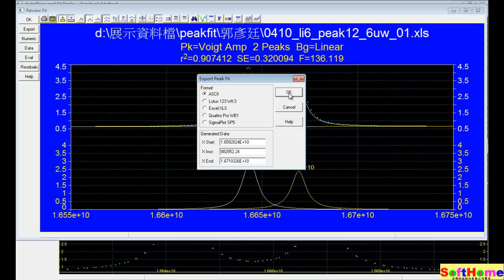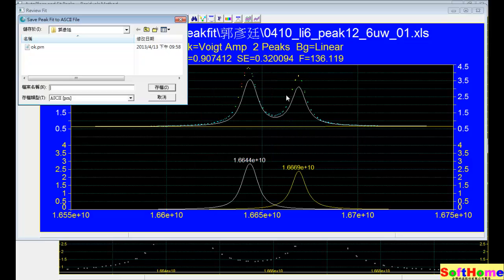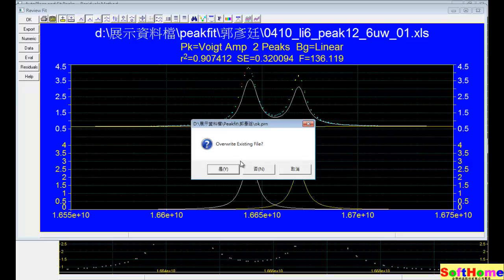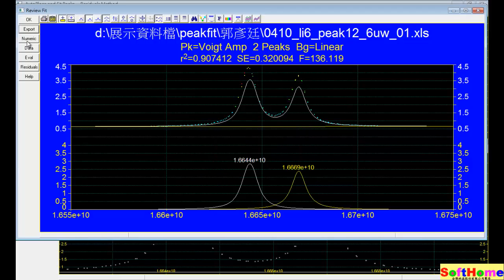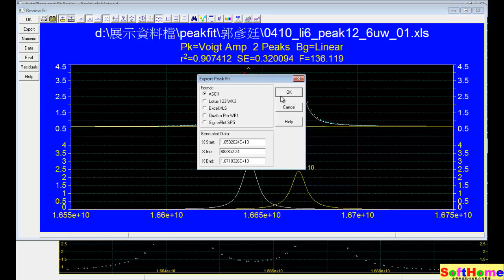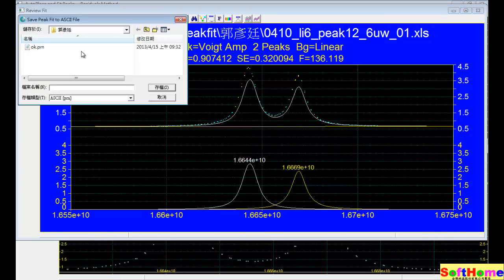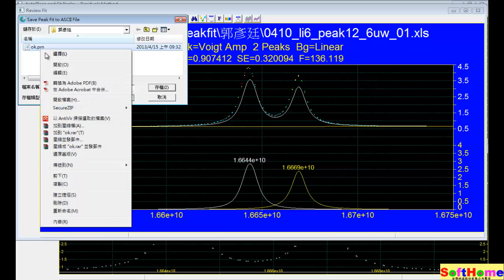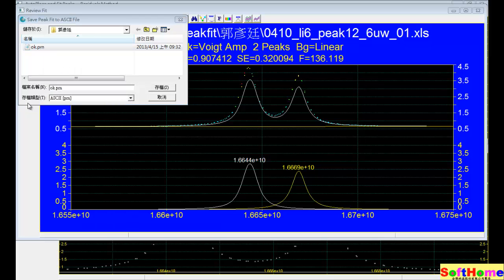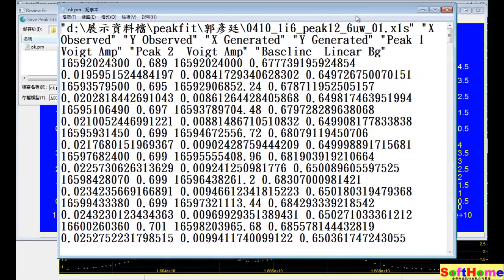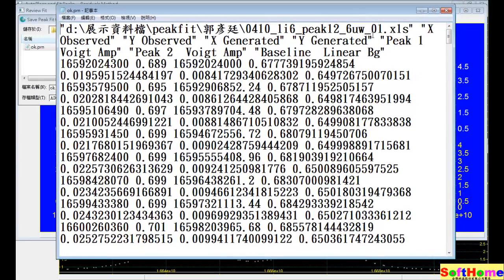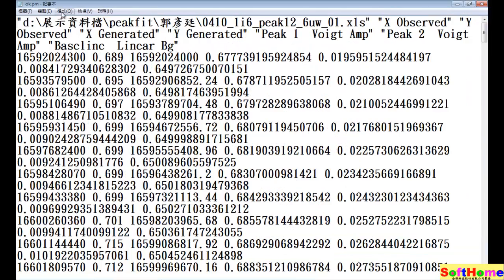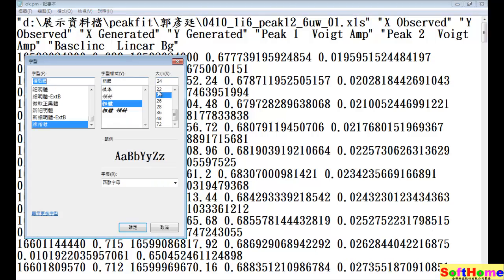And export as the ASCII format. We override. Now we can use this method to display the result. And you can see the result. Change the form size.